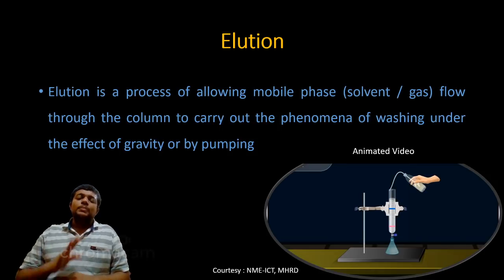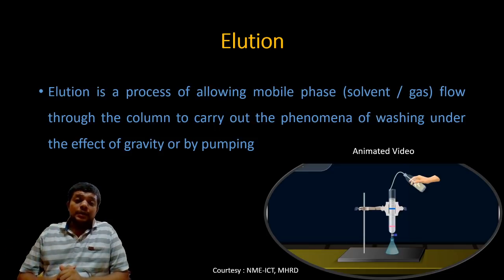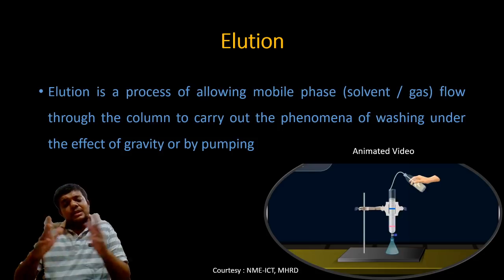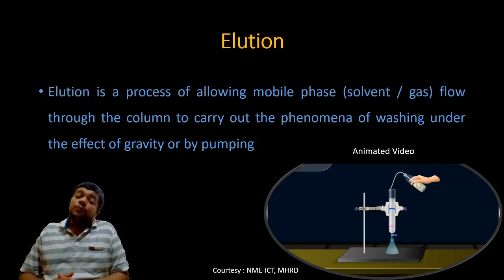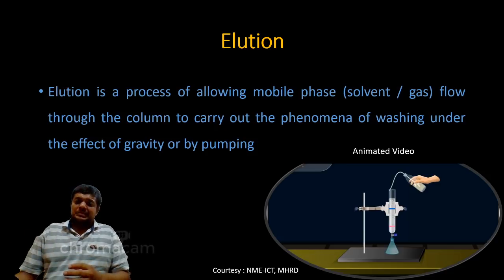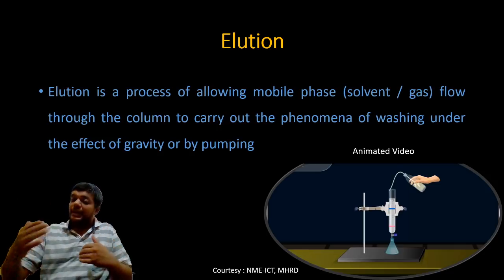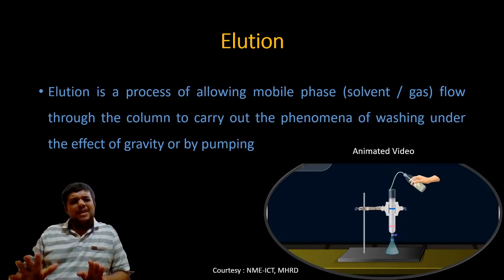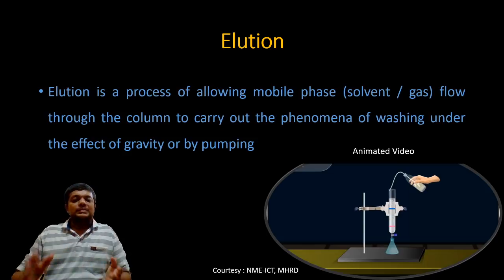But we want to make you participants understand the basics related to each technique. As I told initially, in a video of 50 or 60 minutes, it is not possible to digest complete chromatography. But we want to make you aware of what exactly the basics involved in each technique of chromatography are. Hence, it's a base to remember: stationary phase always plays the key role of interacting with the mixture and separating it into different analytes, whereas mobile phase is a carrier. But in brackets, nevertheless, mobile phase also has its own effect on the samples.